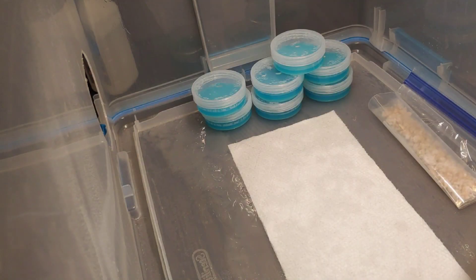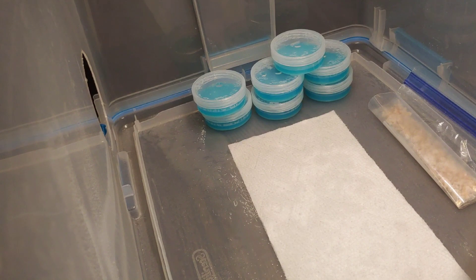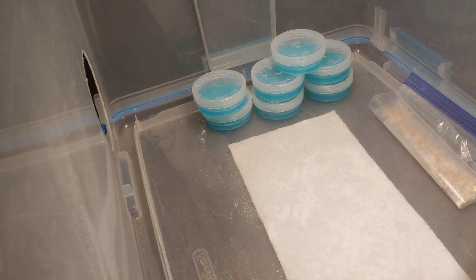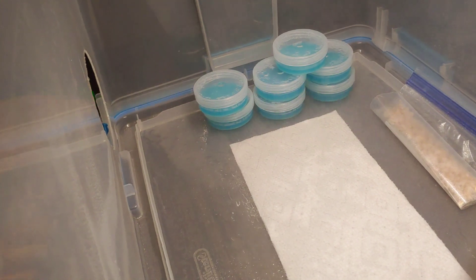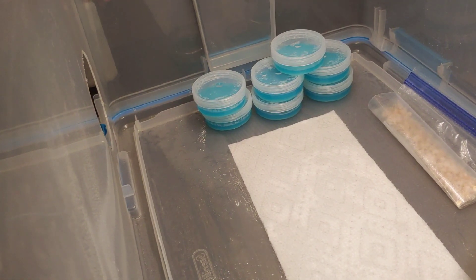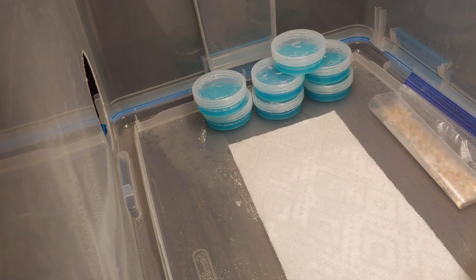All right, let's do some egg artwork. Everything has been cleaned and sanitized. Spraying some more alcohol in there — I always wash my hands and wear my mask, all that neat stuff.